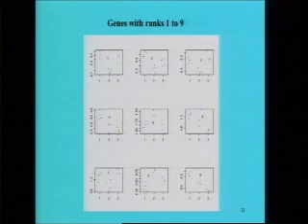For the rank 2 gene, the picture is that it is overexpressed in Vata prakruti and more or less the same in the Kapha and Pitta prakruti. If you go to the rank 9 gene, it is expressed at a low level in the Pitta prakruti, at a medium level in Kapha prakruti, and it is overexpressed in the Vata prakruti.